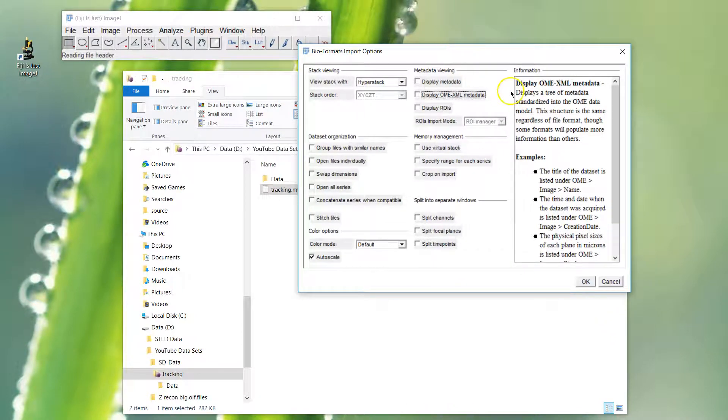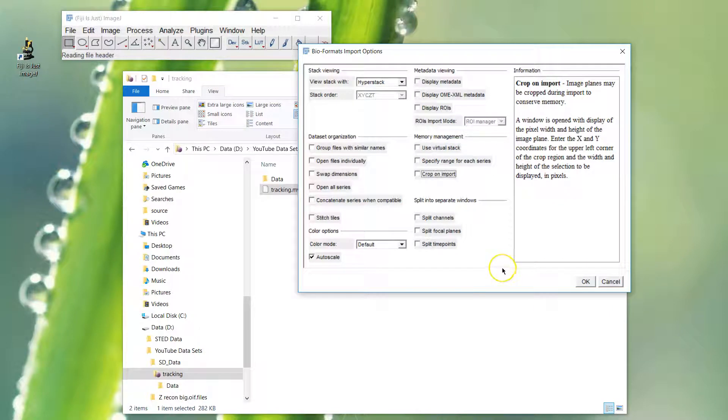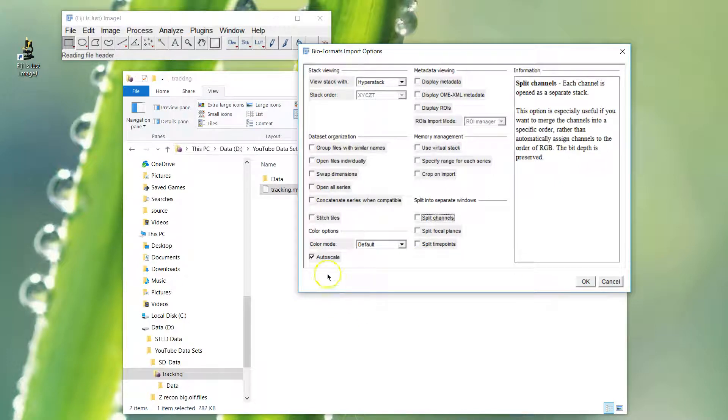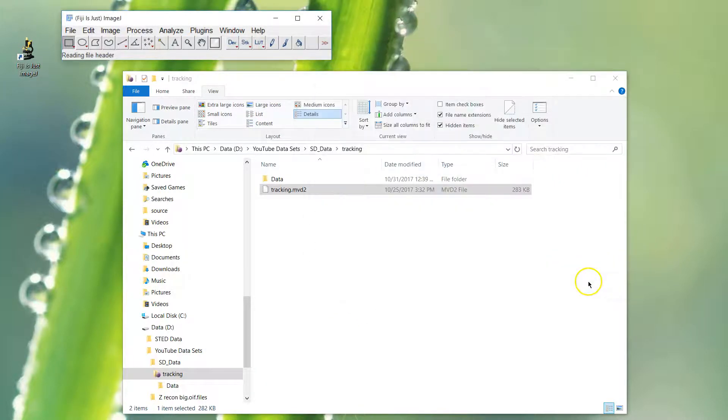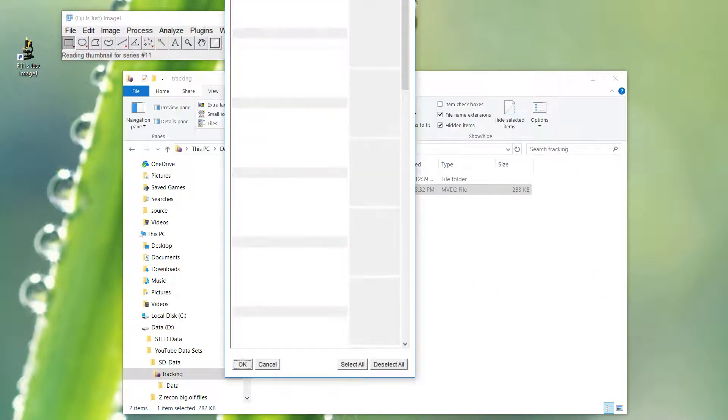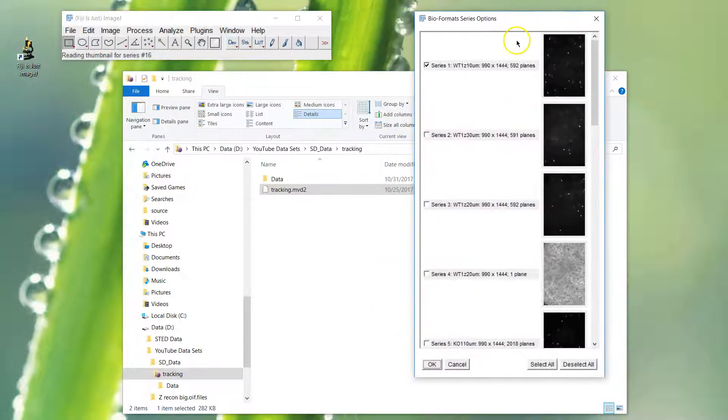Let's drag and drop that MVD2 onto Fiji. We get the bioformats import options. There's a YouTube on how to get this window to show if it doesn't show, and some settings associated with that, so check that one out if you need to. Just go with the defaults normally, just to auto scale essentially.